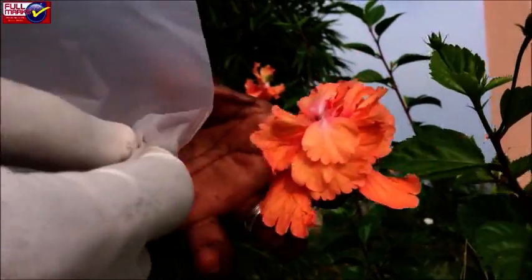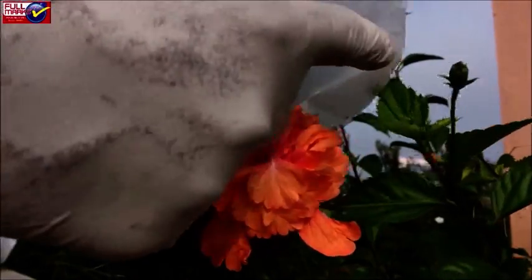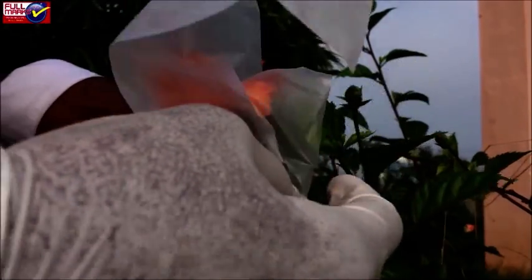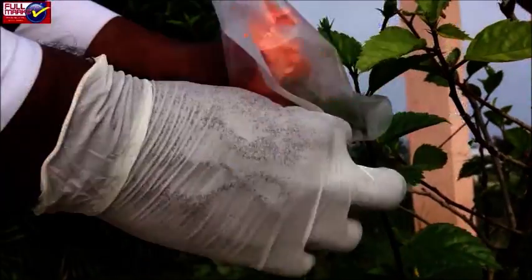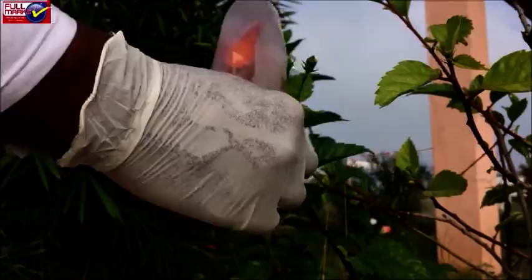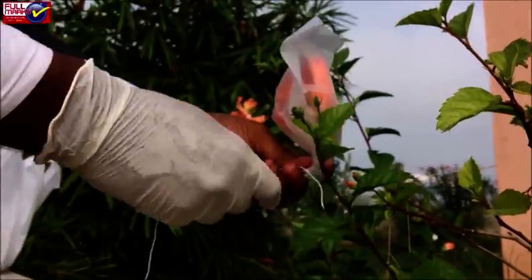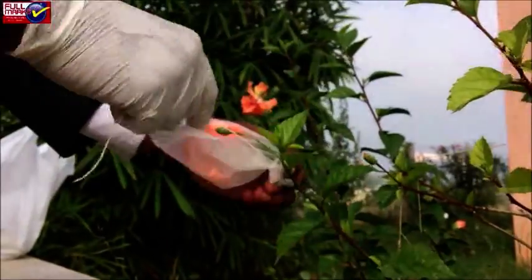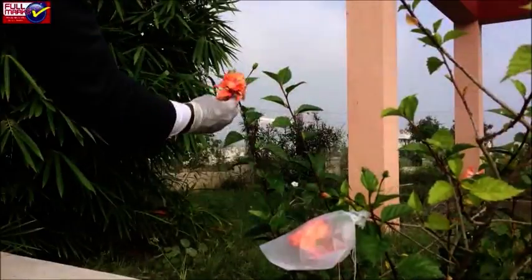Mark this as the female parent plant. Cover the emasculated flower with a transparent plastic bag with minute pores in it to protect it from undesired pollen — that is bagging. Tie the bag in place with a paper clip, string, or thread.